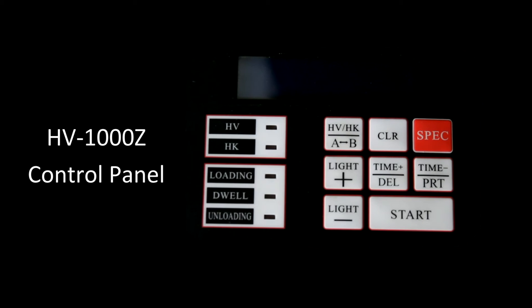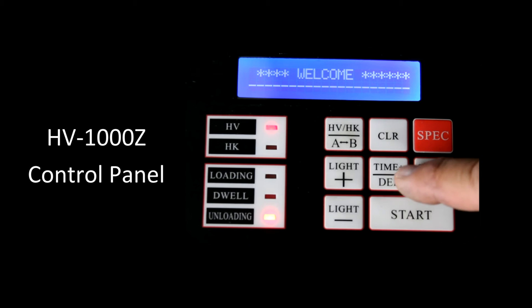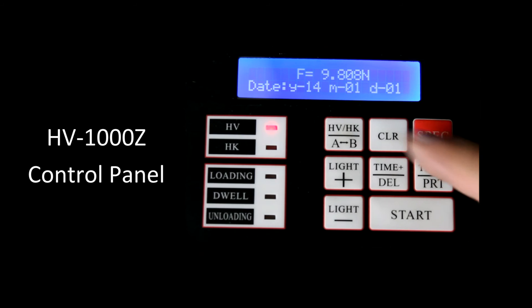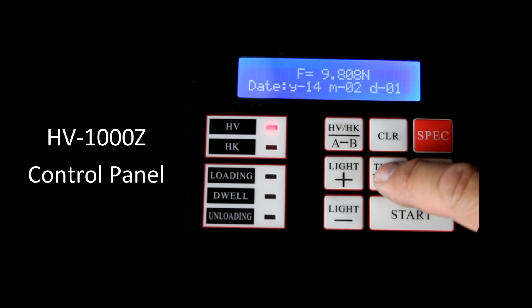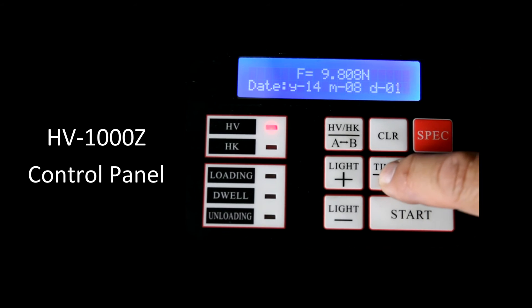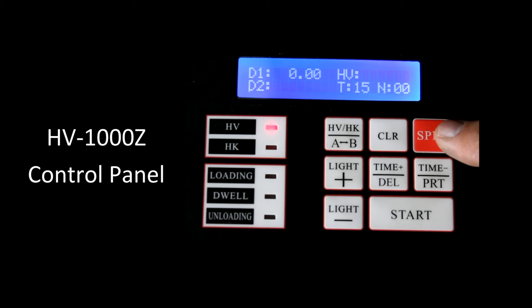The HV1000Z control panel. When we first turn the instrument on, we'll get a welcome screen. As soon as that changes to the date, we want to start changing the date before we lose that screen. We change the year, then hit spec time to go to month and change it to the present month. Same thing with date, then press the spec button to get out of that field.